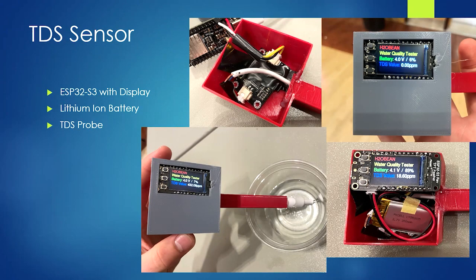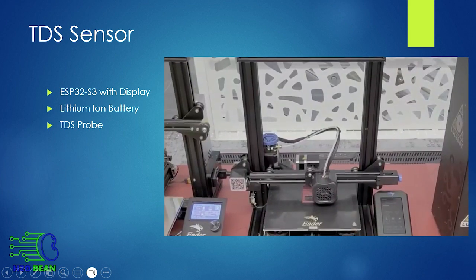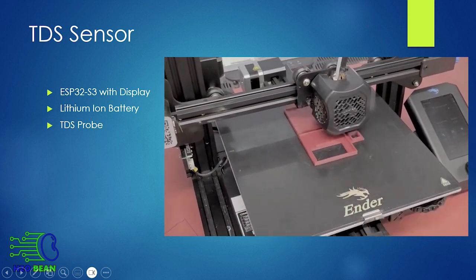Our TDS sensor uses an ESP32-S3 with display, powered by a lithium-ion battery, and houses a TDS probe. The case that houses the computer, the lithium-ion battery, and the probe was constructed out of 3D-printed PLA plastic with help from the Innovation Studio.